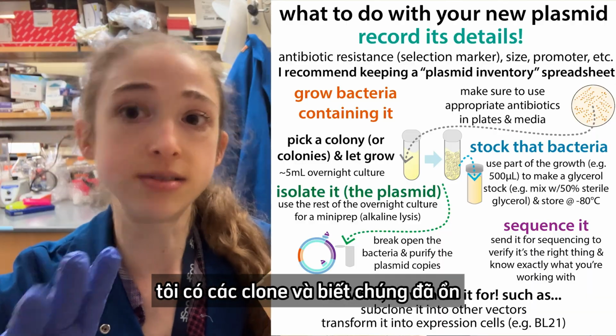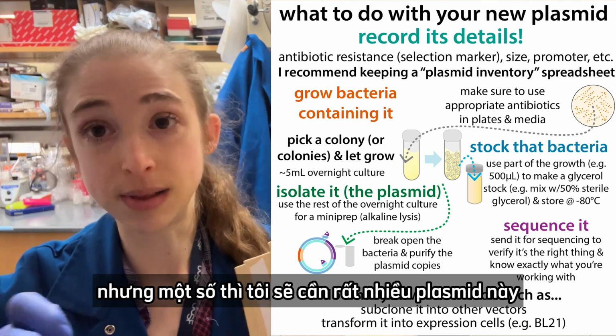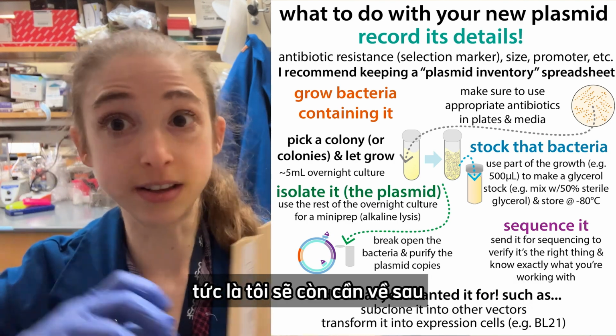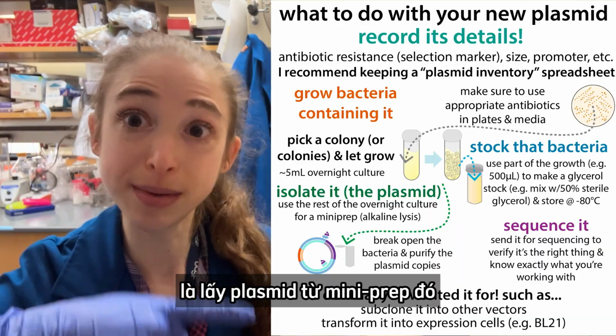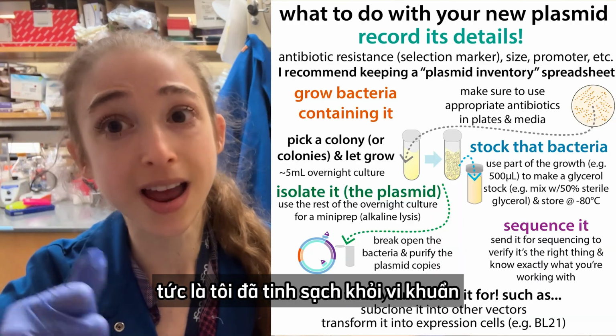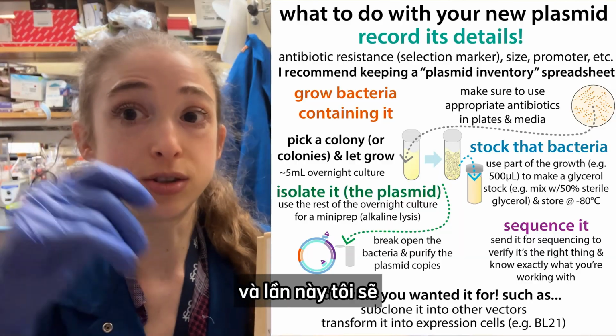So I have those clones, and now I know that they're good. But for some of them, I know I'm going to need a lot of this plasmid. I'm going to want it in the future as well. So what I'm going to do is take that plasmid that I mini prepped out, so I purified it out of the bacteria, and now I'm going to stick it right back in those bacteria. And this time I'm going to plate it again.